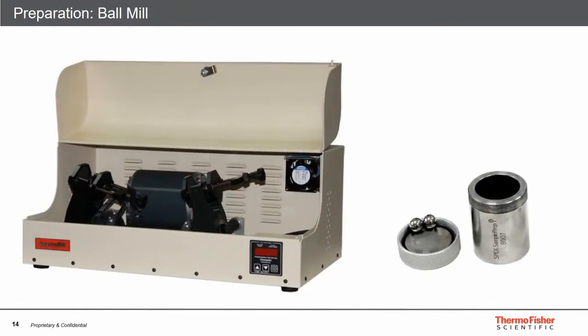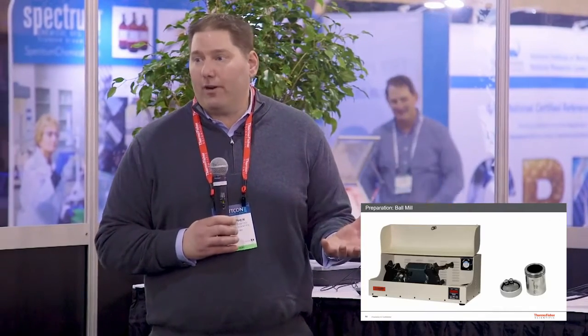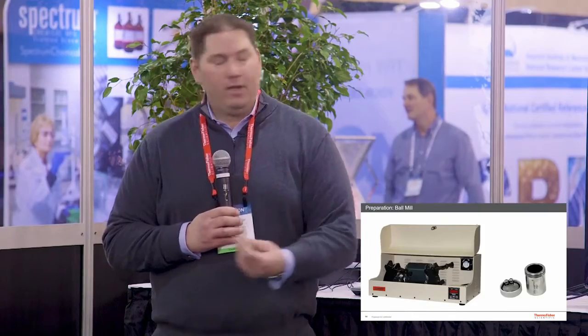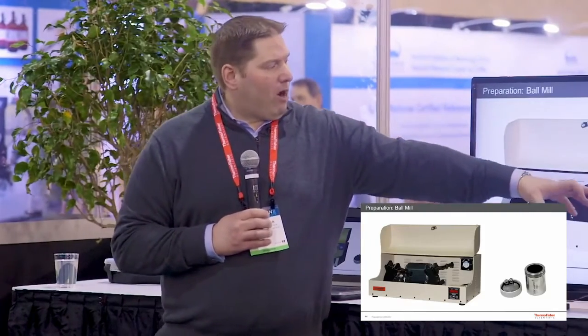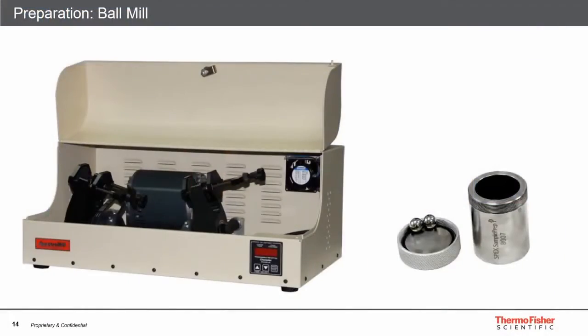You can use a ball mill for harder materials. This is much more ideal compared to something like a ring and puck. A ring and puck mill is designed to actually destroy the crystalline phase because you're trying to get rid of that component in X-ray fluorescence. So it's ideal for X-ray fluorescence, terrible for X-ray diffraction. So a ball mill, which is just based on impact, shaking and grinding, is ideal for this type of technique.